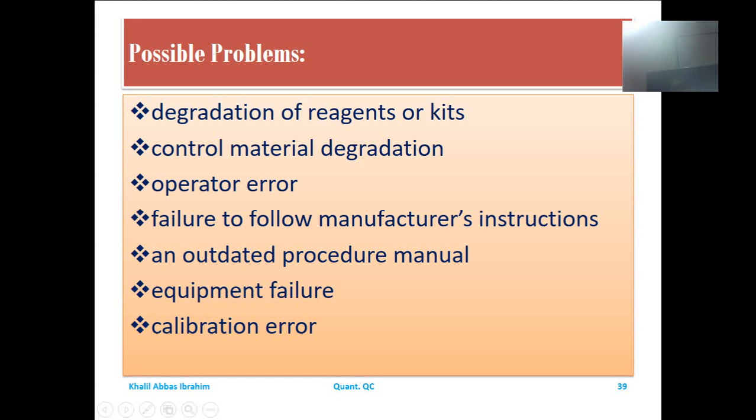One of the causes of errors in the laboratory is equipment failure. Equipment in the laboratory should be well managed, controlled and observed from time to time. Close observation is very necessary for the different technologies that you are using in the laboratory, for the sake of getting the maximum use of those technologies and preventing them from falling outside of control.